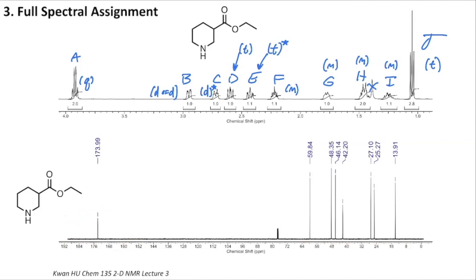So looking at the structure, hopefully we can tell why that is. Again, we're in the 170 range. So that is just going to leap out to me and say that is our carbonyl carbon. Again, we're not really trying to nail down these assignments right away, but since it's just so far away and it looks a lot like the previous example, we're going to go ahead and pre-label that one as our carbonyl peak. We're also going to label it as carbon 1 because it is the furthest downfield.